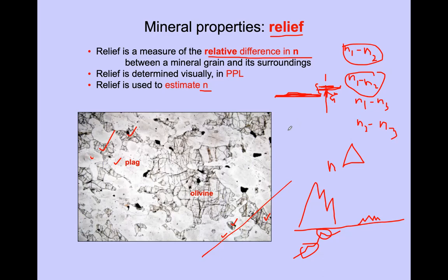When we select these glues, we need a glue, otherwise you can't hold the sample on the glass. But if you use a kind of multi-bond or something, it is too thick, and the light cannot properly penetrate through that, and the features are also not visible. Therefore, there should be a very, very transparent type of glue.